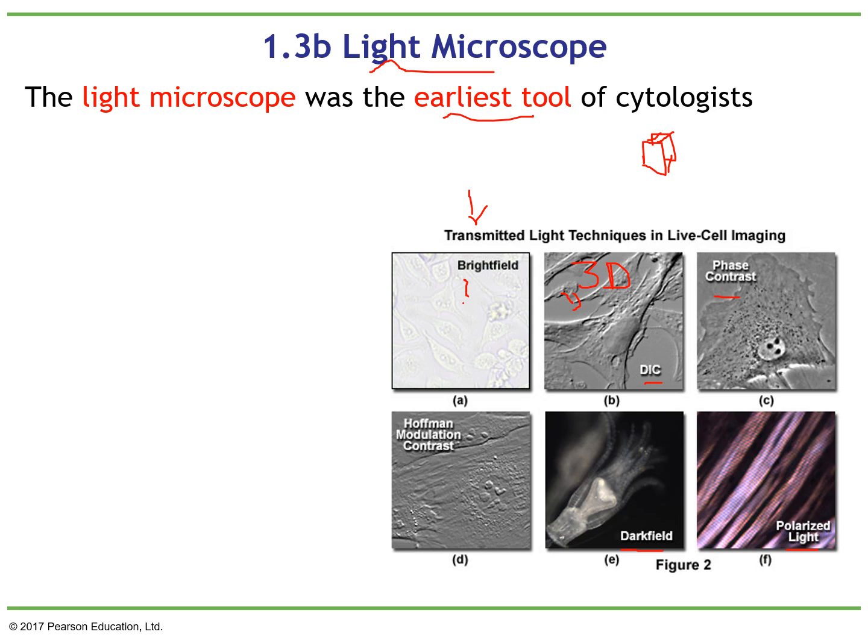Here we're playing with light to give the idea that there are structures that are above or ones that are below, and all of this we do by playing with optical, with physical principles. Okay, this one is called phase contrast. This one we are actually going to use in the lab, and it's pretty cool. Again, if you remember, light is waves. So what we're going to do is play with the refraction of the light.